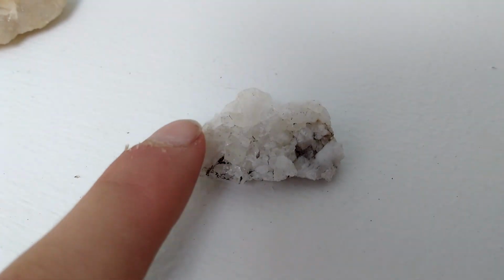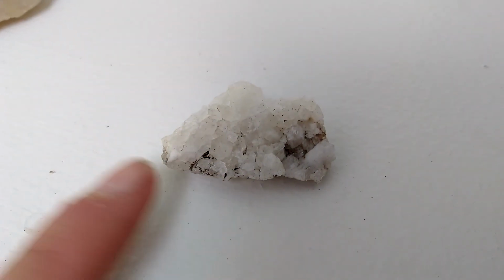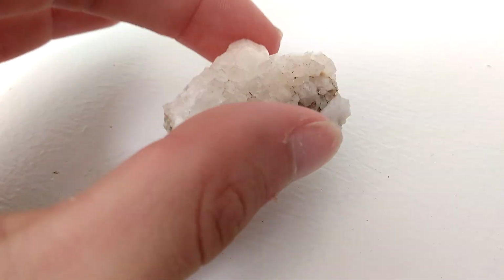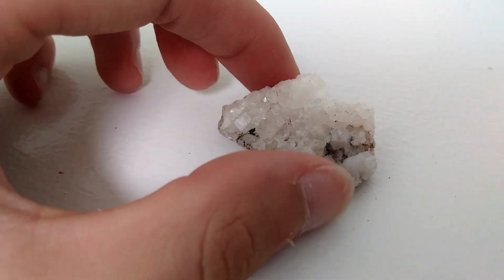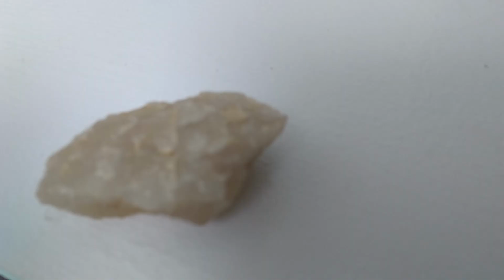My prediction is that this will be a lot cleaner and the edges will be more prominent, and there'll be like straight edges, as you can see in that reflection when I move it. That's a crystal there, compared to this, which will be, I believe, a lot more jaggedy. So let's look at it.